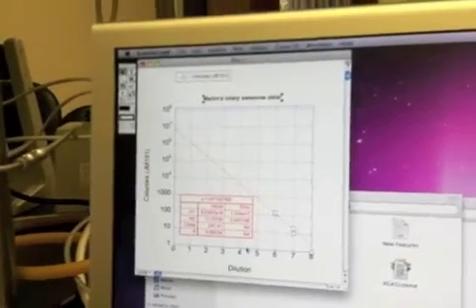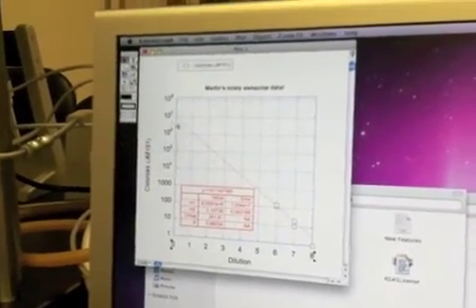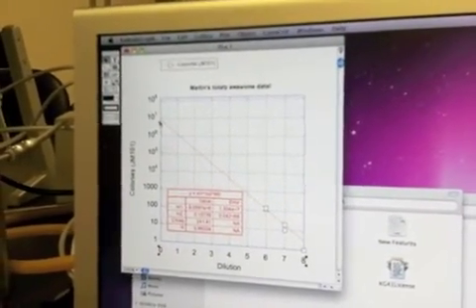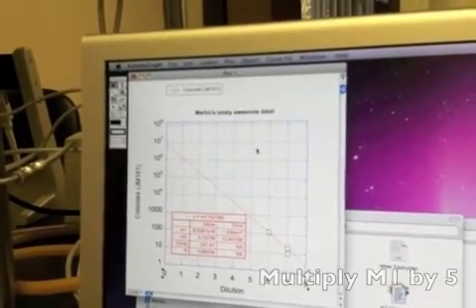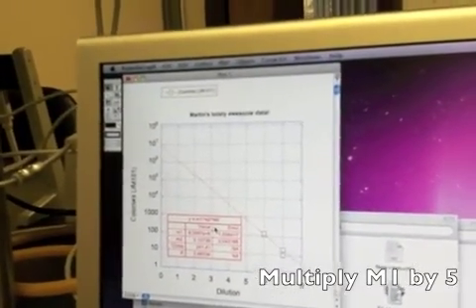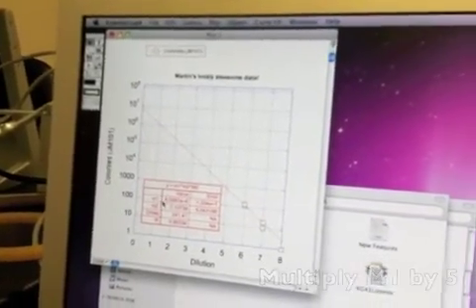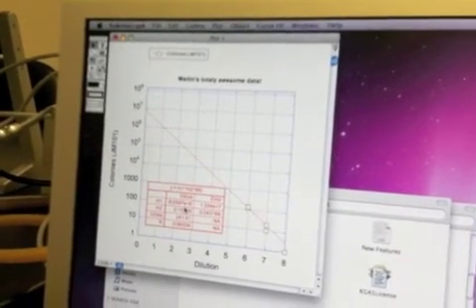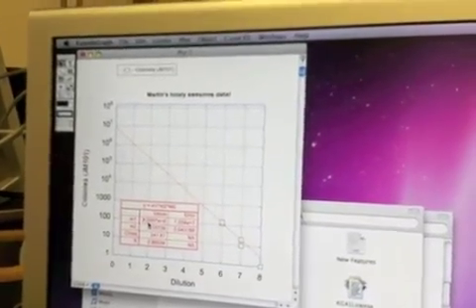And yeah, now the data looks a lot easier to see, and importantly, the meaning of the data is made clear because this y-intercept, that's the measurement that we wanted from the very beginning. How many cells were in that colony to begin? Now remember, on the plates, we only plated 200 microliters of the 1 milliliter available. So we need to multiply this number by 5 to compensate for that partial sampling that we did. And so this 8 million becomes really 40 million cells. 40 million cells, that's a lot of cells.